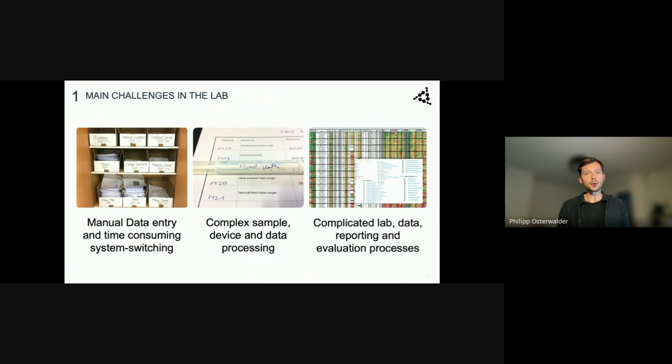My follow-up questions about this: can I be sure and can I trust the data in these spreadsheets? How can I make sure they are not manipulated? Is there any kind of traceability within this data?